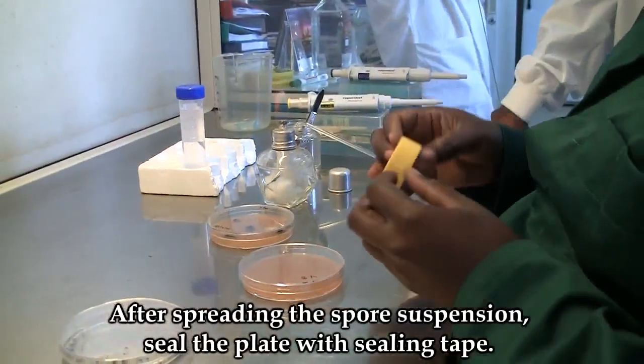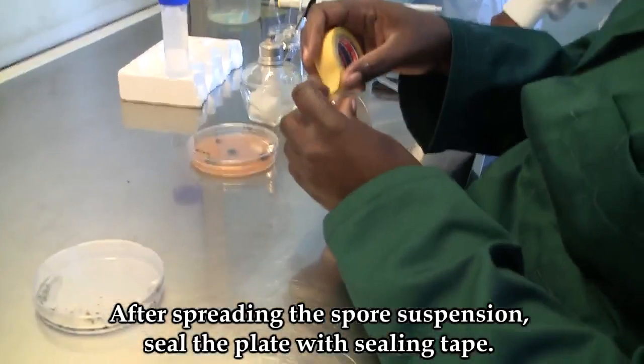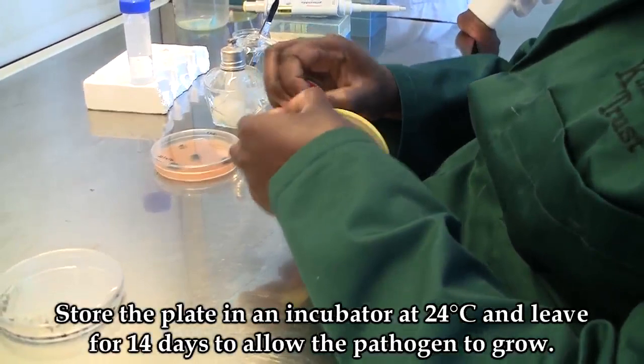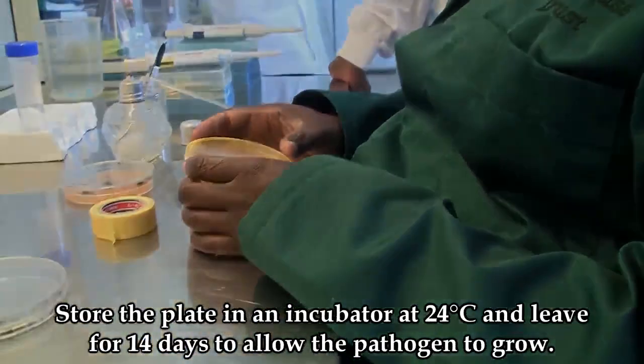After spreading the spore suspension, seal the plate with sealing tape and store it in an incubator at 24 degrees Celsius. Leave for 14 days to allow the pathogen to grow.